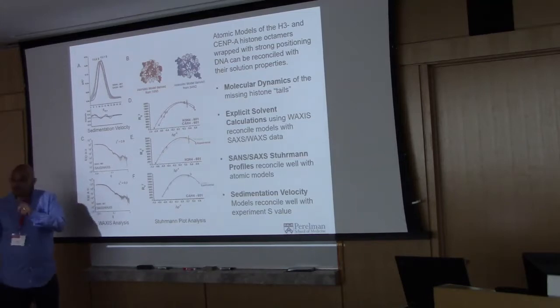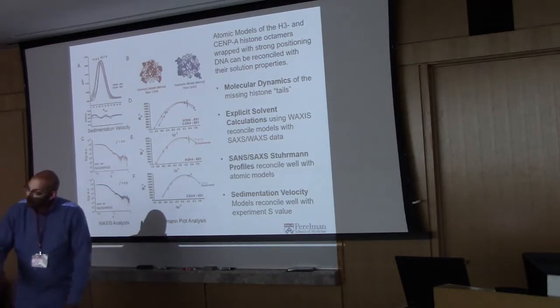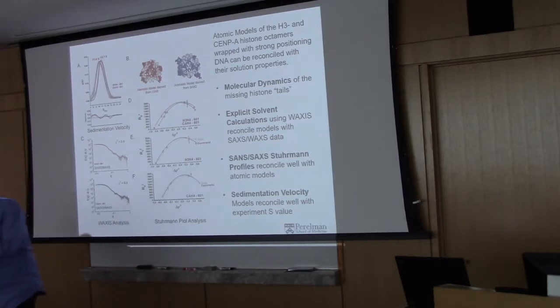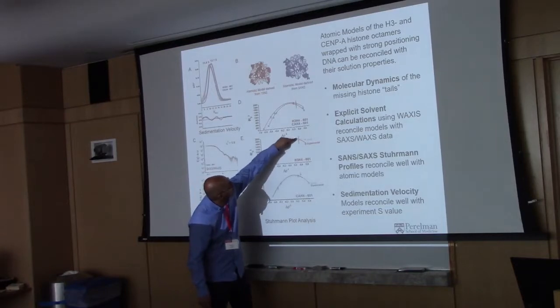you wouldn't be able to resolve it. This is what I love about this study. If you just did X-rays alone, you can convince yourself that every nucleosome I looked at was exactly the same. That's right. That's what I was getting at. This is my favorite part of the study. It's a very obscure, very esoteric point, but it's such an important one. Because of contrast, people can scatter nucleosomes out the wazoo and convince themselves that all of them are statistically identical. But I think that's phenomenology, because the X-ray scattering point is right here.